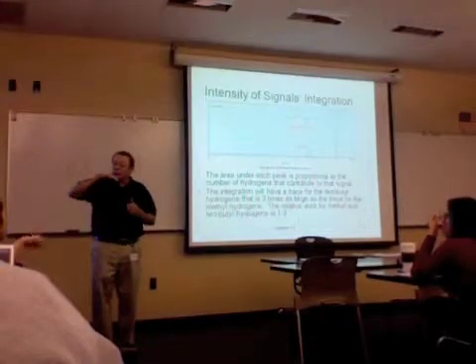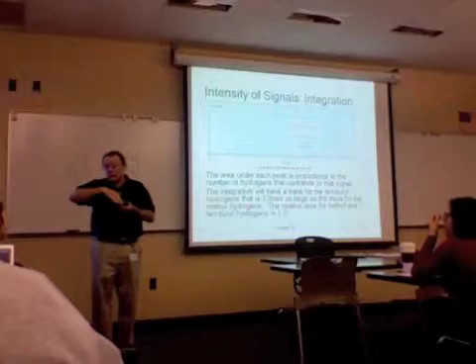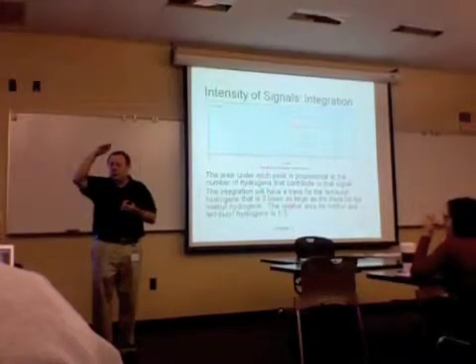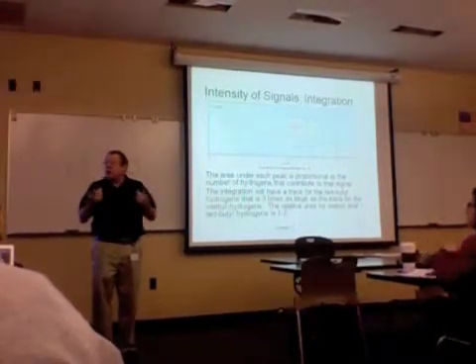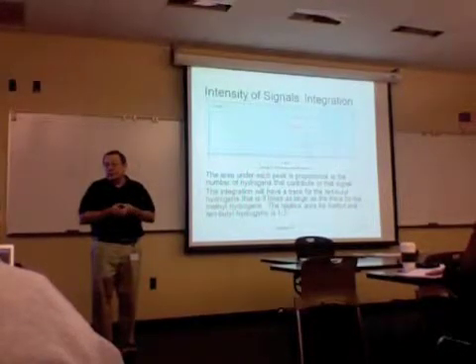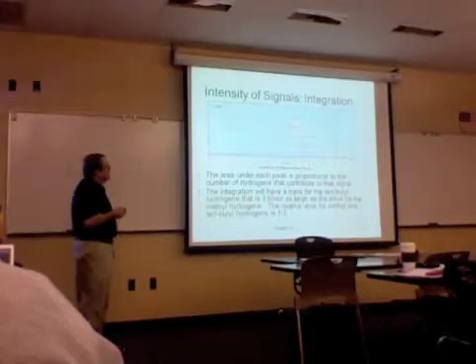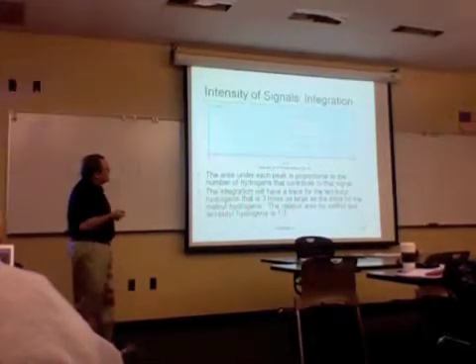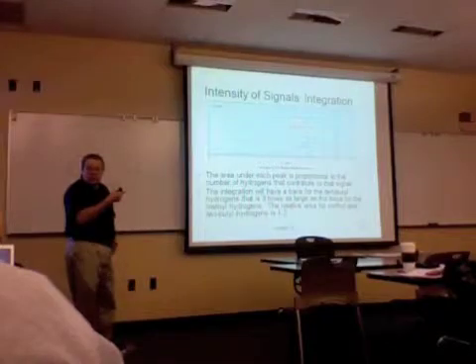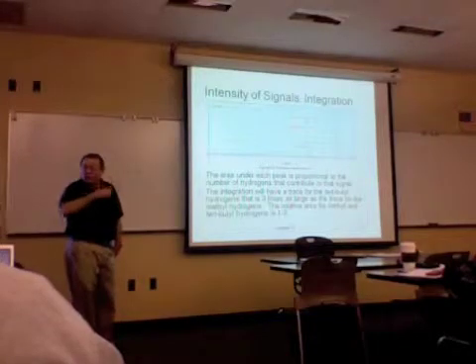If you've got the little drifting line, you can just sit down and measure it and say, this goes up 3 units and this goes up 5. That's a 3-to-5 ratio. Your structure should have a proton ratio of 3 to 5 that fits that. Okay? The problem with this is it doesn't tell you if this is 1 hydrogen to 3 hydrogens, or 3 to 9, or 4 to 12, or whatever. This just tells you the relative ratios.